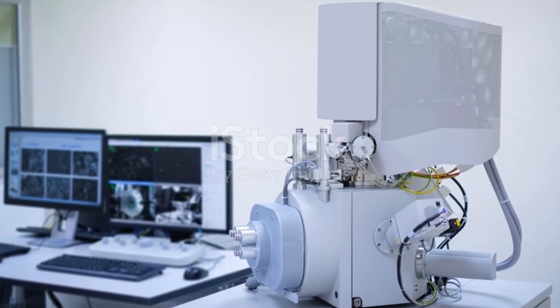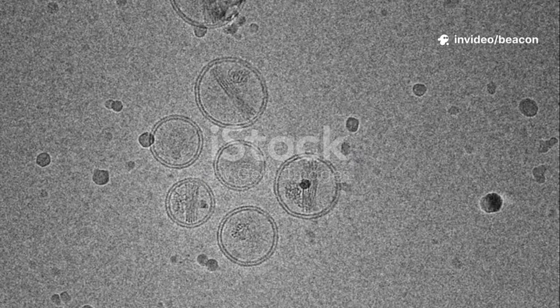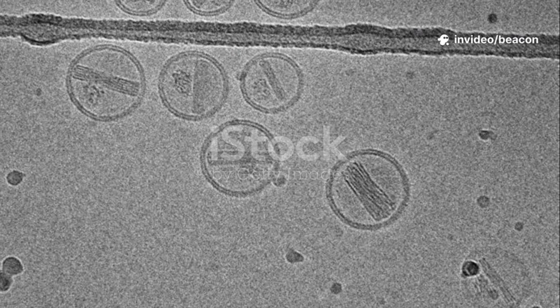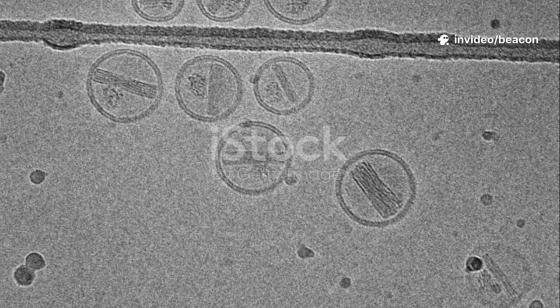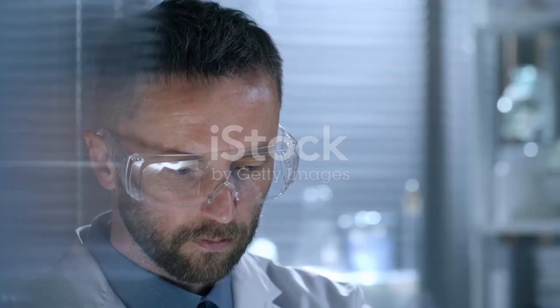Making nanoparticles is only half the battle. The real question is, how do you know what you've made? Size, shape, surface charge, optical properties, everything must be characterized. In this video, we'll break down the top three most used techniques to characterize nanoparticles in any lab.